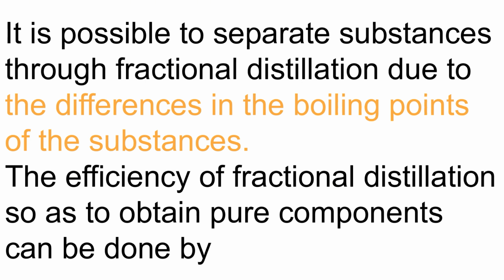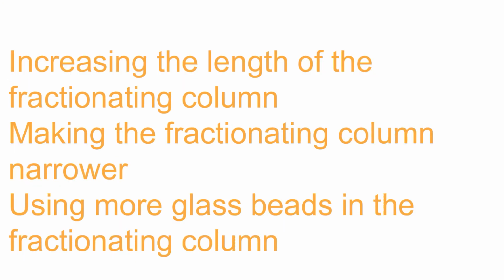And also, the efficiency of the fractional distillation so that we can obtain pure components can be increased by increasing the length of the fractionating column, by making the fractionating column narrower, and also using more glass beads in the fractionating column. Those three factors will make the fractional distillation process more efficient and lead to the production of pure components from the mixture.